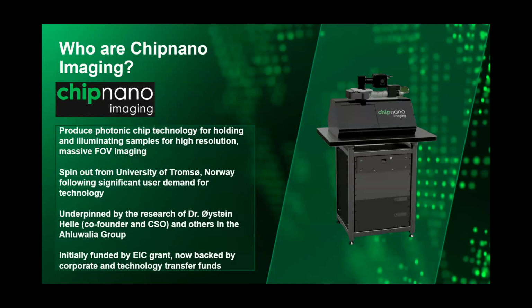And what they have developed is a photonic chip technology for holding and illuminating samples for high resolution, massive field of view imaging, all based around TIRF. And the reason they did this is because they developed something for research. There are papers on their developments. And then they found within the university there was a huge amount of demand for the things that they'd actually built.